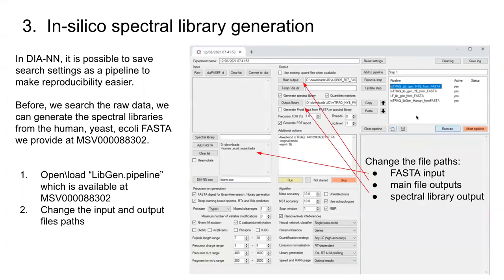Once you load that in, it's going to populate a few different things. You'll notice there are now four different setups. If you clicked through some of these, you would see that they each make their own spectral library — it's its own independent experiment. In this case, we're looking at generating an mTRAQ library.